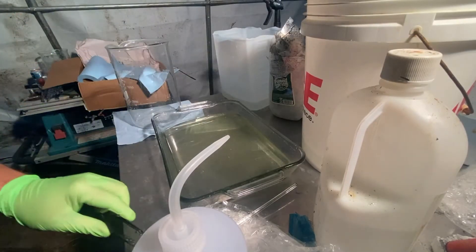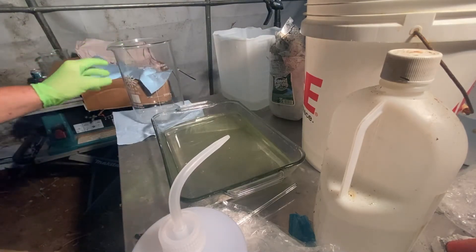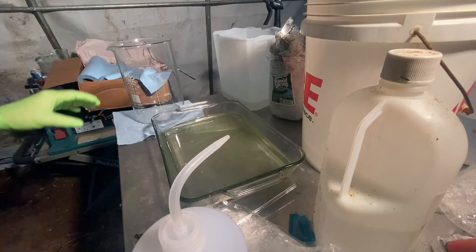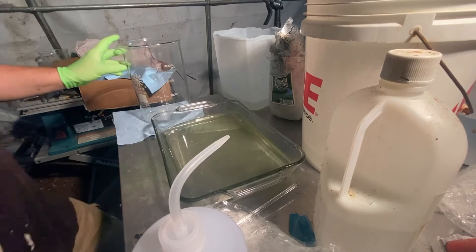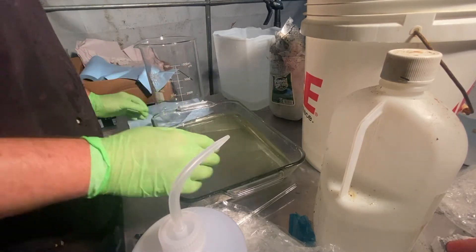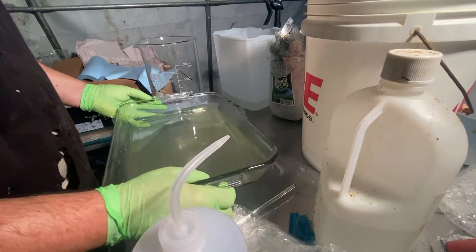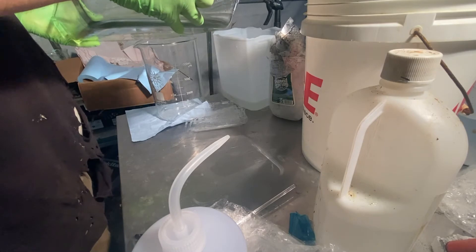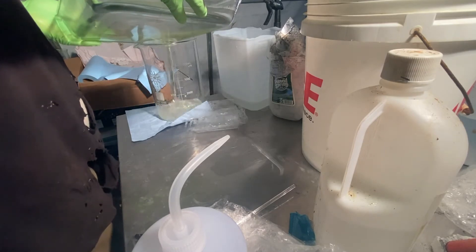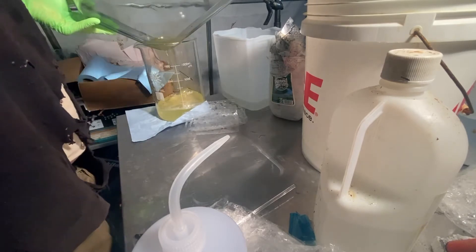Now that we've processed the keyboard mylars in the nitric acid, we're going to put it into a 5,000 milliliter beaker container. We're going to water it down with distilled water, and then we're going to add hydrochloric acid to turn and precipitate the silver to silver chloride.